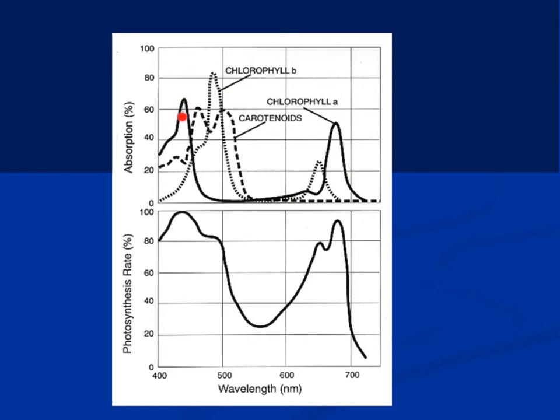If you choose this wavelength and the peak is going high, it means chlorophyll A is being produced or reduced, depending upon what is happening, and the same thing with chlorophyll B. Suppose this peak is going down and this peak is going up while you are processing and you check all the samples, it means that chlorophyll A is being degraded and B is produced, and that will change the shade of green color in your food product.